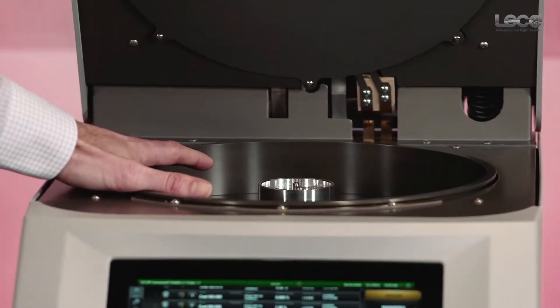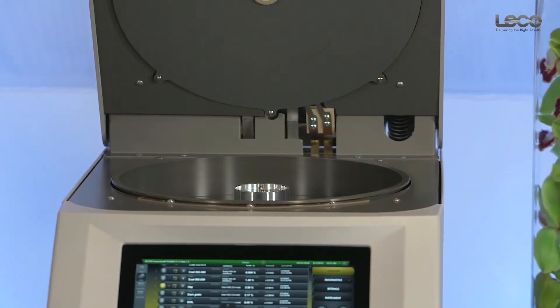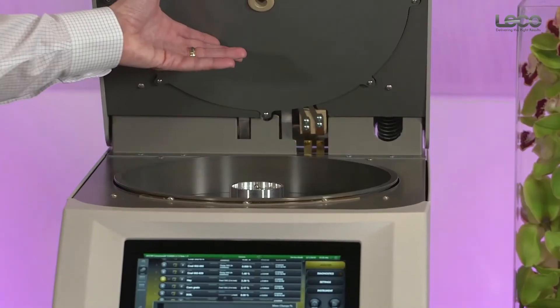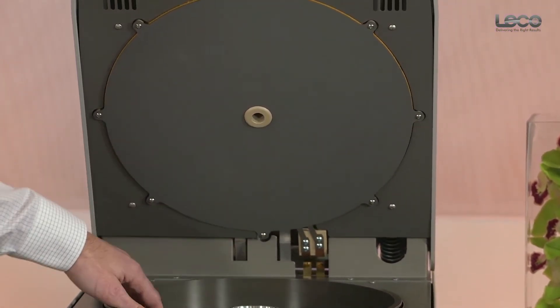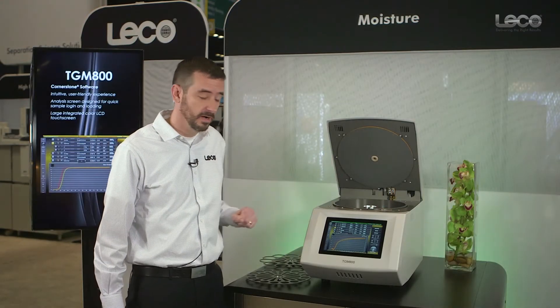The TGM-800 contains a circular anodized aluminum furnace that supports temperatures from ambient to 150 degrees Celsius. We have heating elements embedded in the furnace at the bottom and at the top, an exhaust port for ventilation gases at the top of the oven, and two purge ports to introduce the ventilation gas at the bottom of the oven.